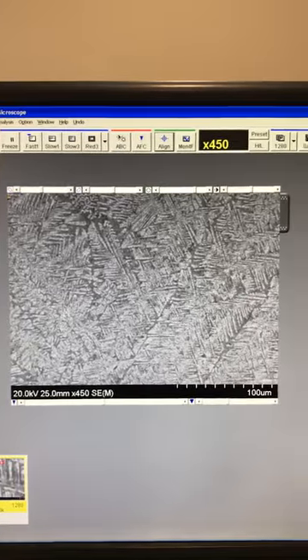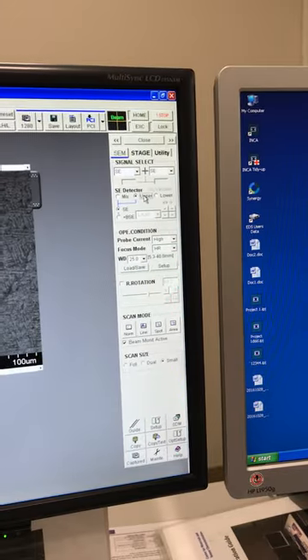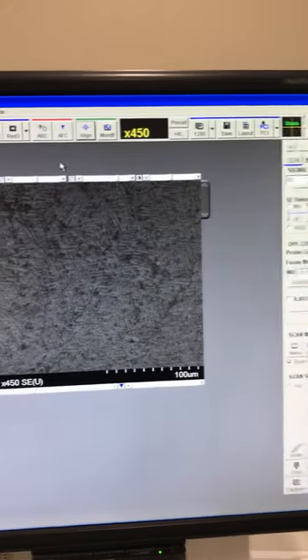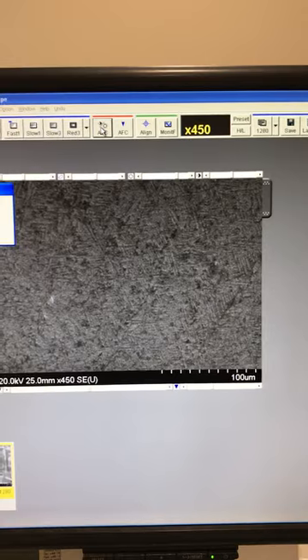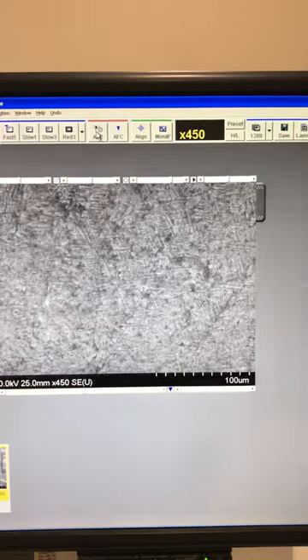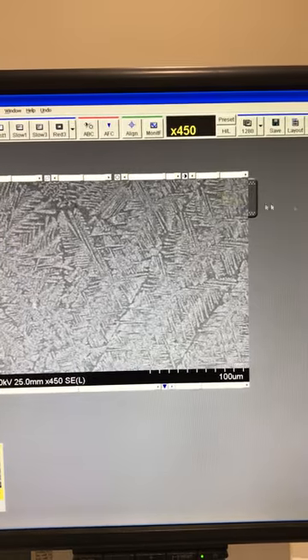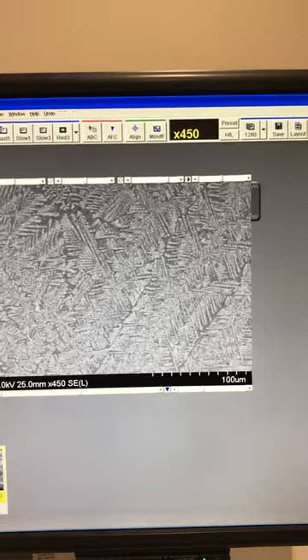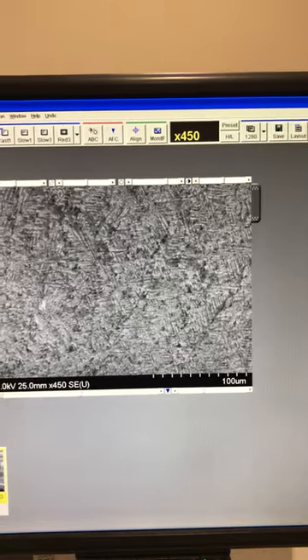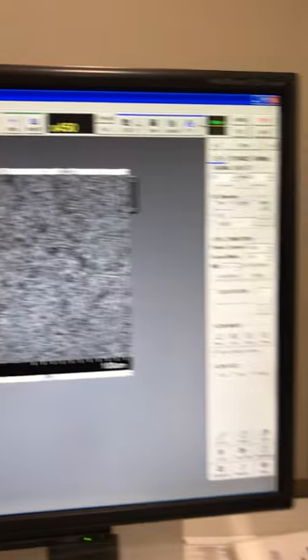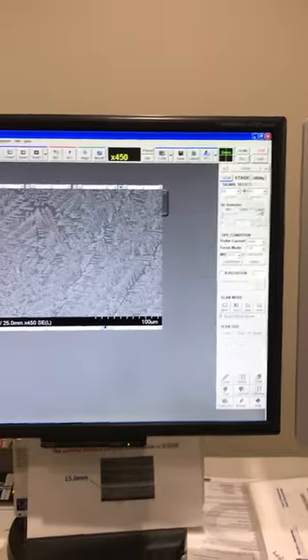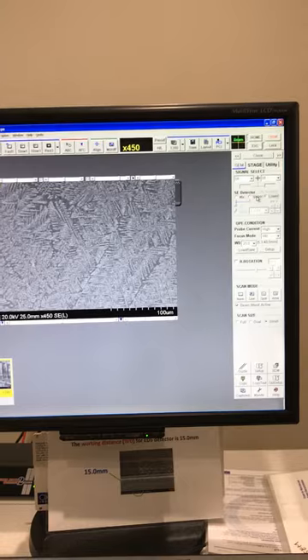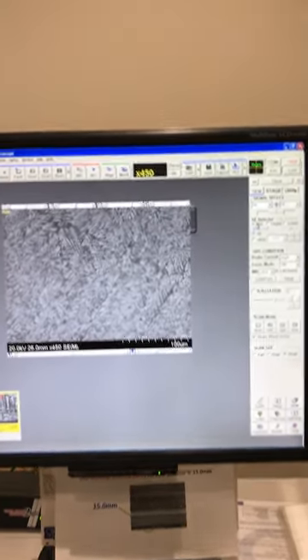I can choose upper and see my difference of the brightness and contrast. This is the upper image and this is the lower image. So you can see there's two different images coming from two different detectors and you are seeing mix.